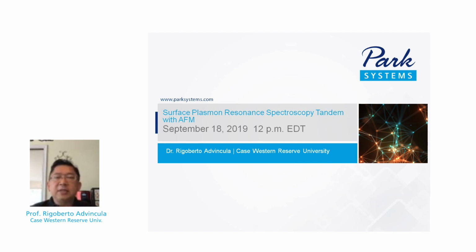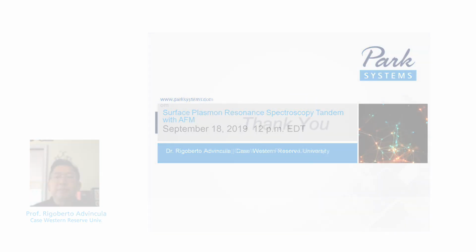SPR is a very interesting and important method for looking at surface phenomena, nanostructuring, optical and dielectric properties of thin films. But also in our previous experience, we have actually combined AFM, SPR, and electrochemistry into one. So hopefully our audience will be back for that next month.